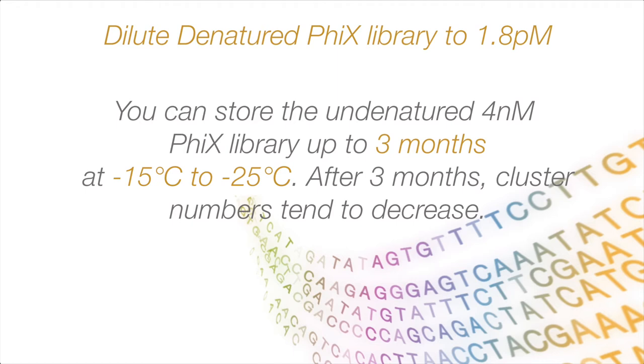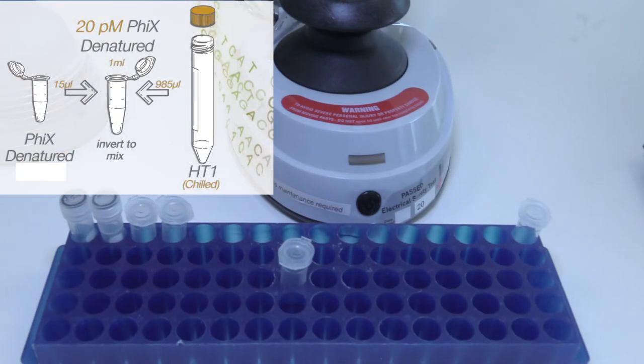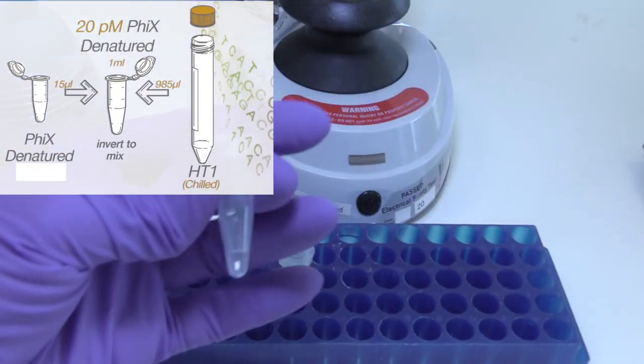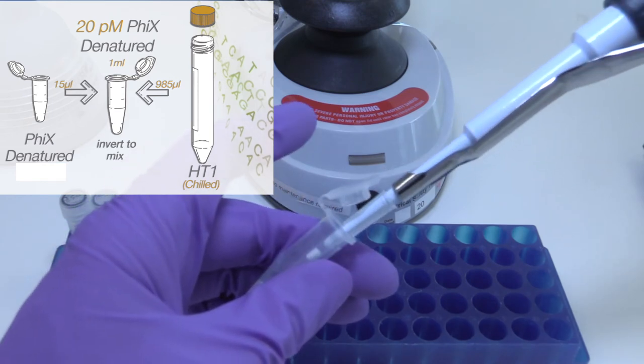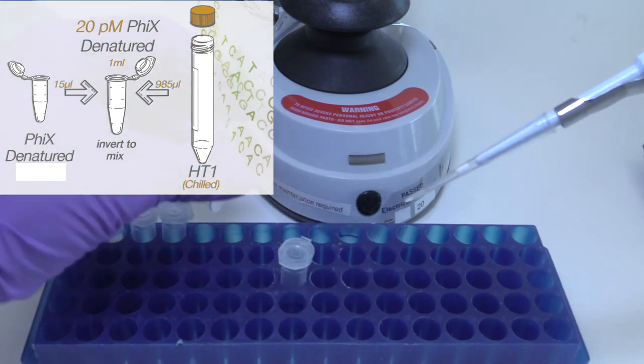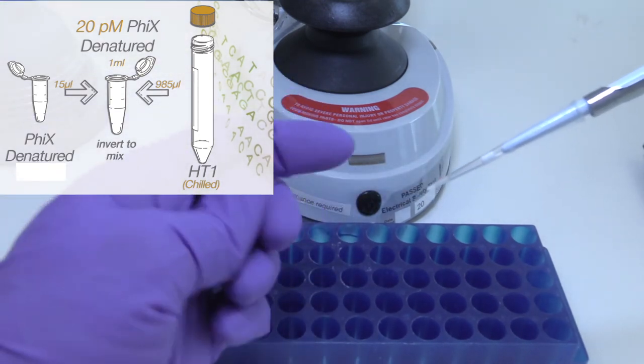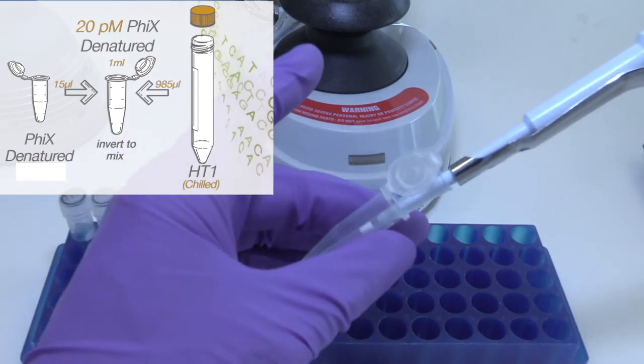Following next is diluting the denatured Phi-X to the desired loading concentration. Add 985 microliters of pre-chilled HT-1 to the tube of denatured Phi-X. The total volume in the tube is now 1 milliliter at 20 picomolar.